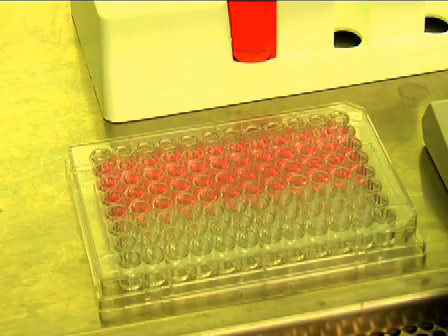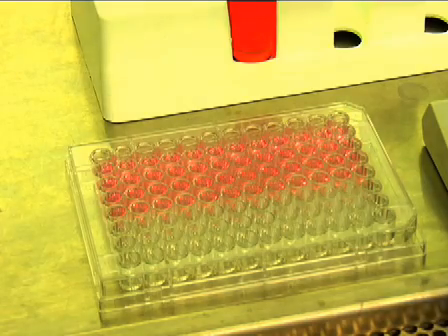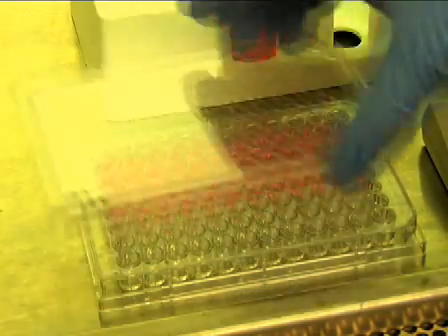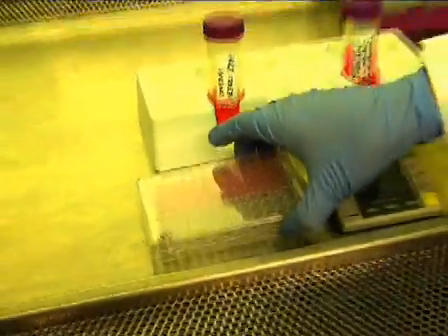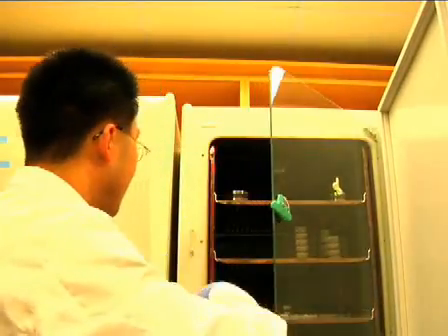It is also important to include 3 wells of cells that will be left untransfected. The average luciferase activity in these wells will later be subtracted as background. Place the 96-well plate into the 37 degrees C incubator and grow the cells for 24 hours.